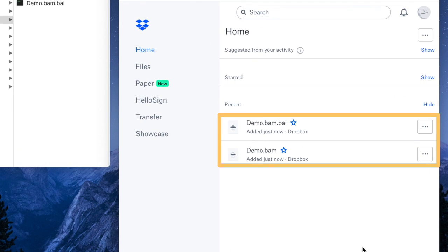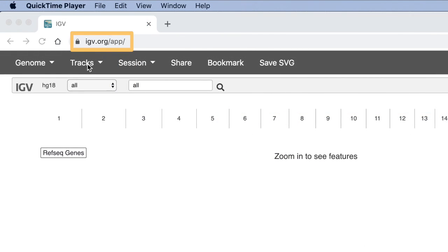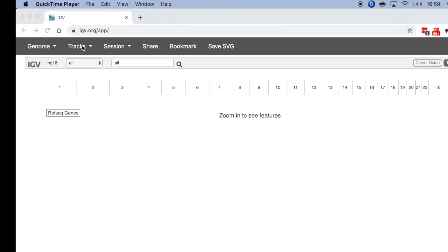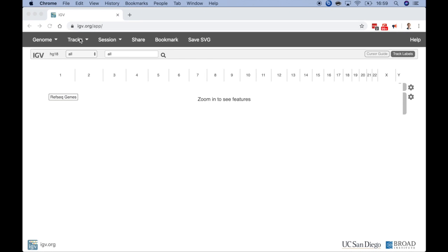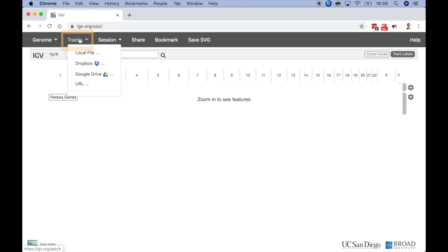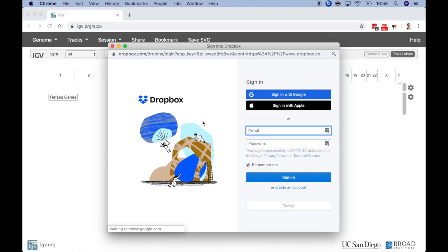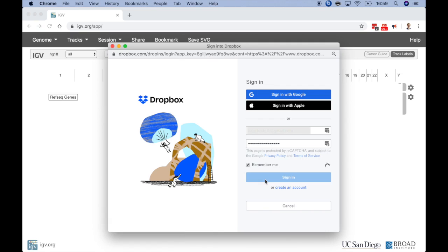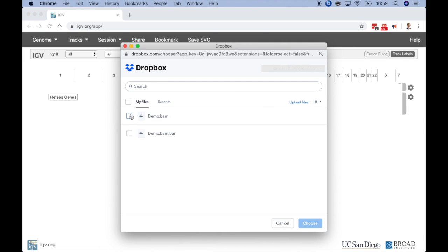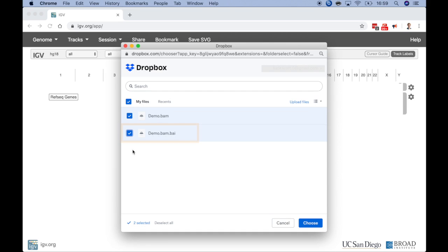Now that my sequencing data is on Dropbox and accessible to my colleagues, let's open it up in IGV web. To load the data from Dropbox, go to the Tracks menu, select Dropbox, enter your Dropbox credentials, and select your data. Note that if you're loading a BAM file, you will also need to load its corresponding index file ending in BAI at the same time.